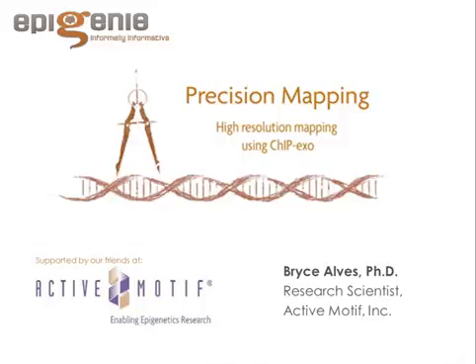For CTCF, we found that about 50% of the peaks were novel compared to ChIP-Seq, and when we looked at FOXA1, which is very ubiquitous, much like CTCF, we found an even larger proportion, about 70% of the peaks identified were novel compared to those that we traditionally had seen in FOXA1. So we definitely see a large amount of peaks that have not previously been identified by ChIP-Seq. Oh, that's pretty powerful.